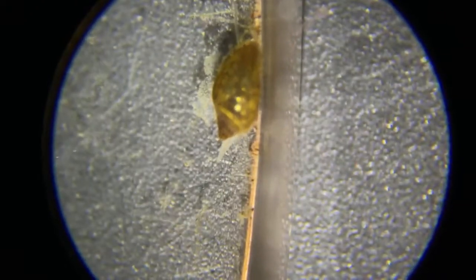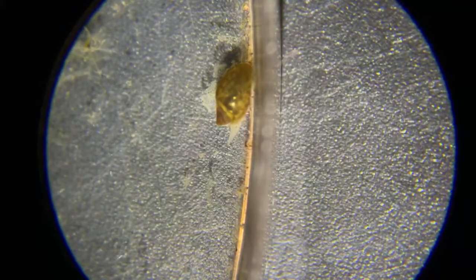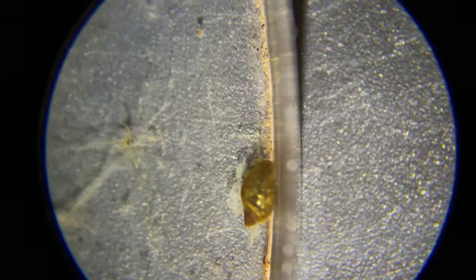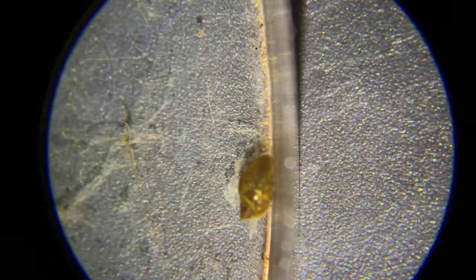Look at all the paramecium in there. See those little white things swimming around? Those are paramecium. You go out and put your hand in a mud puddle, and those are going to be on it. You can go get 10 gallons of water and look for aquatic water bears and not find one.